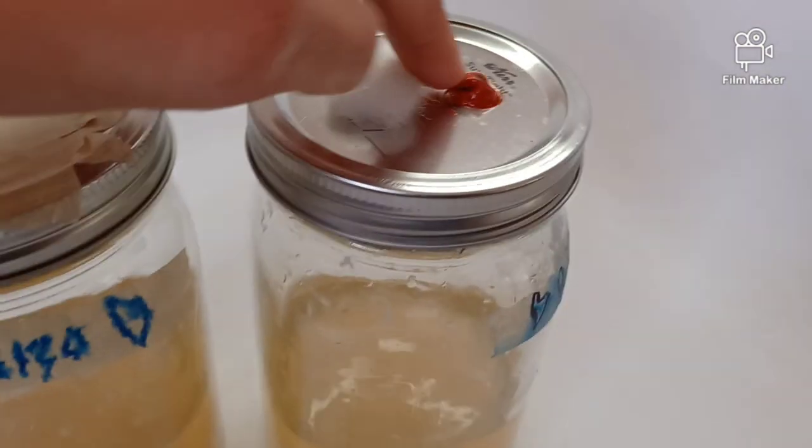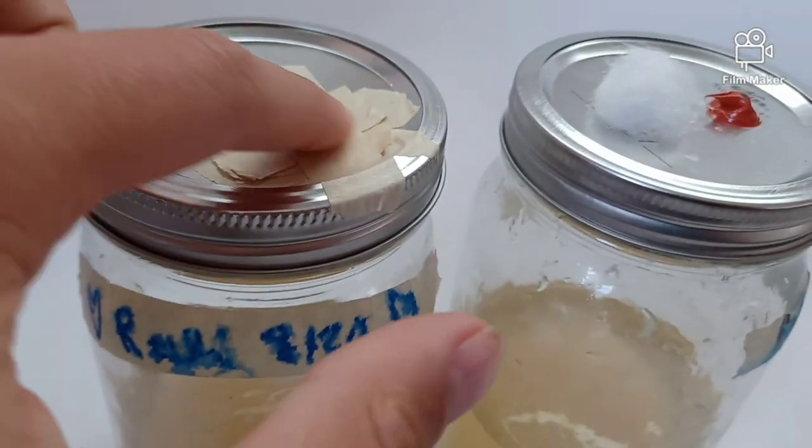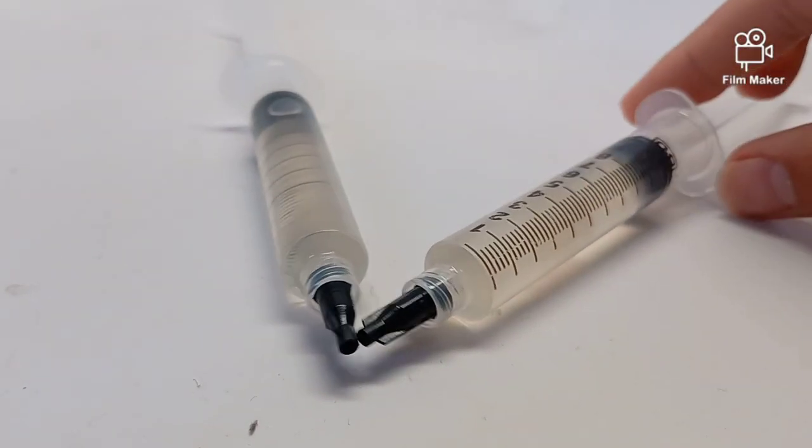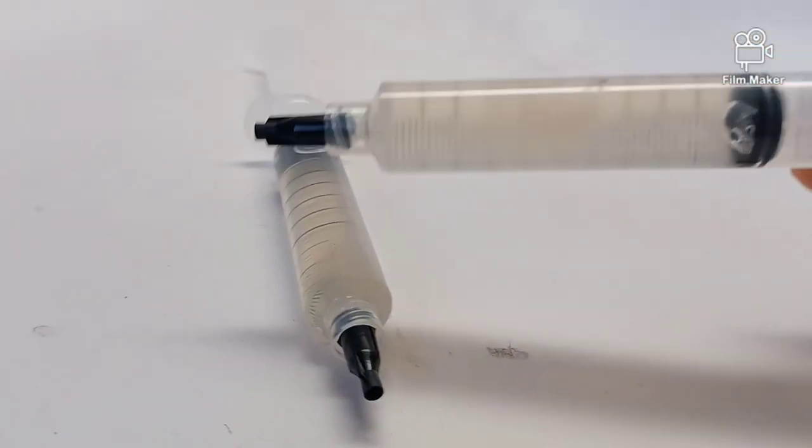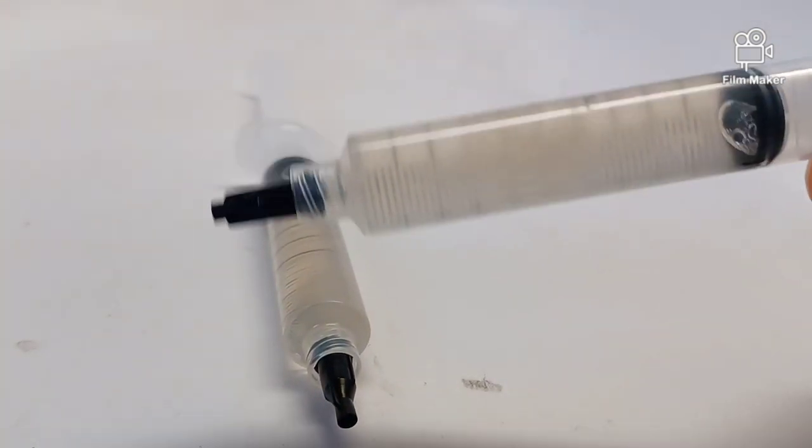I have one of them with the rubber gasket and one of them with just some masking tape. Now here's an example of what you will get if you decide to order a liquid culture syringe from our website shroomfather.com.